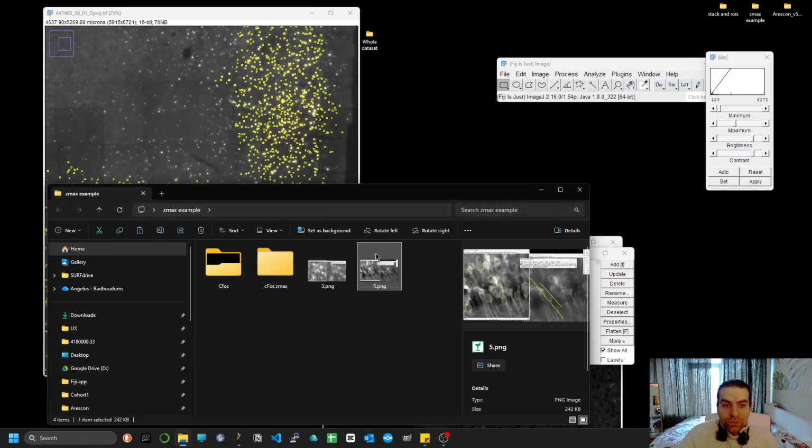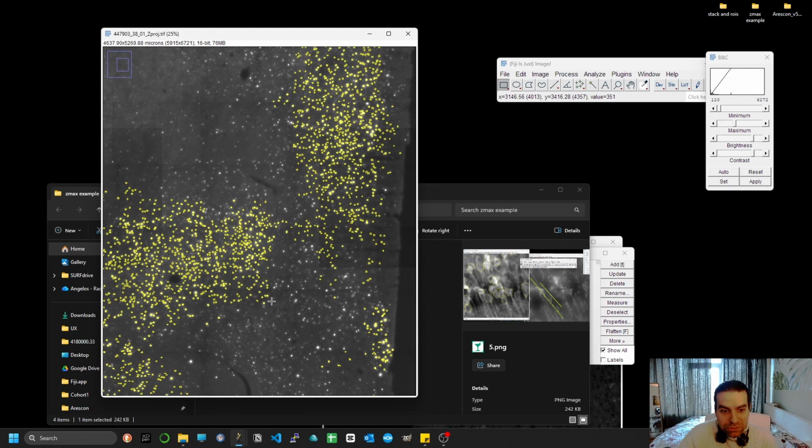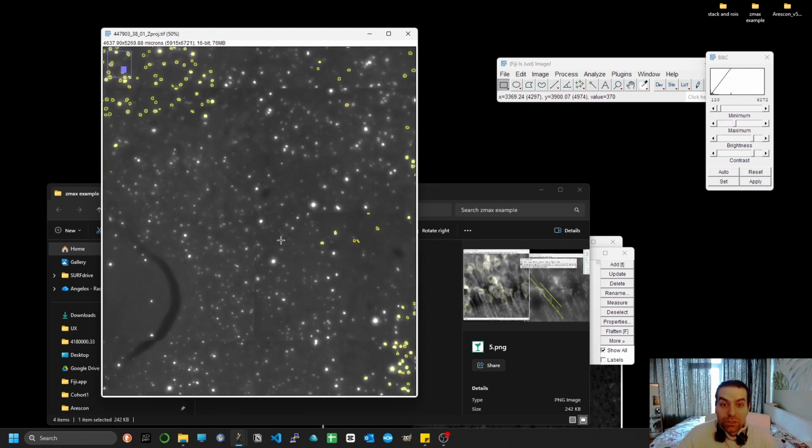Now, if you want to make your network more lenient to detecting more cells, you can do it from Cellpose. There are variables like the cell probability threshold and flow threshold, which you can use as arguments in the model eval function to get more cells.